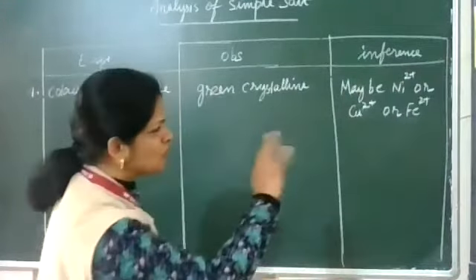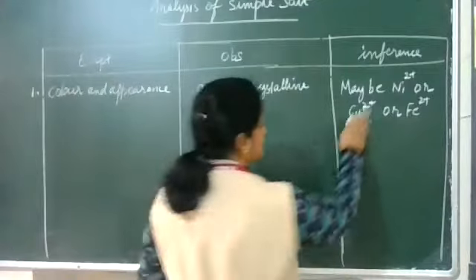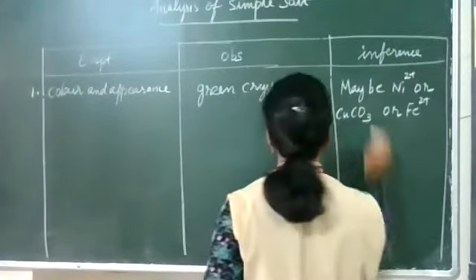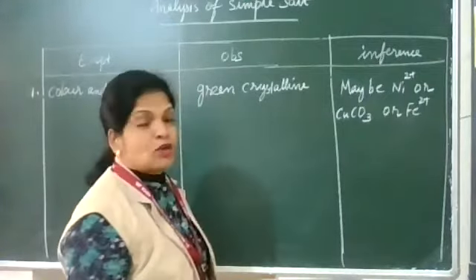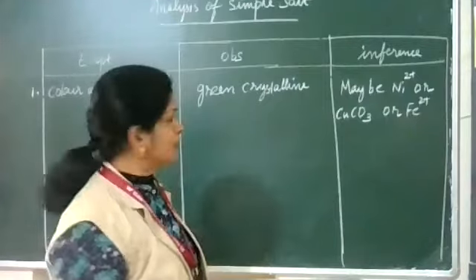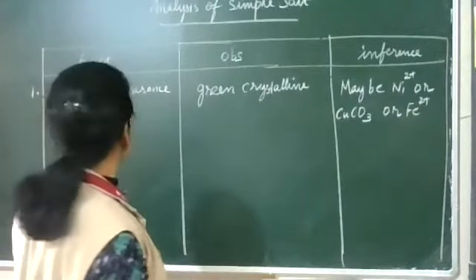Still, we are writing all of this as a greenish color once. Cu2+, if I write copper sulfate, normally we see copper sulfate as blue. So the coloring appears. This way we are starting.